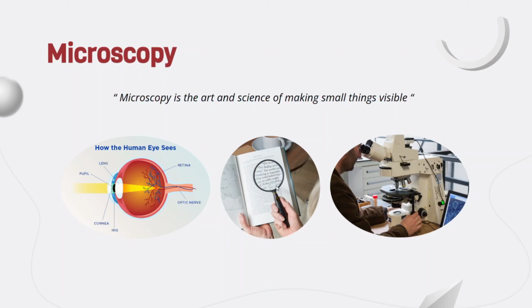In fact, they come in different powers, for example 10x, 40x, 100x, and produce a real inverted image of the sample. And at the end, ocular lenses, also called eyepieces. They are located at the top of the microscope where you place your eyes, and they further magnify the image produced by the objective lens, typically by 10x, and present a final virtual image to the observer.